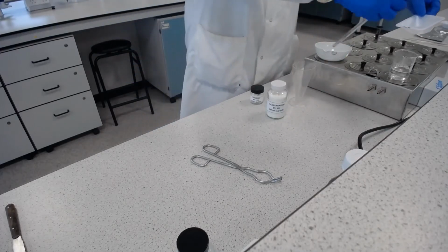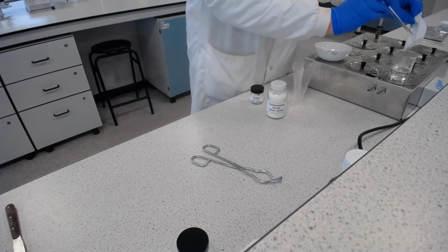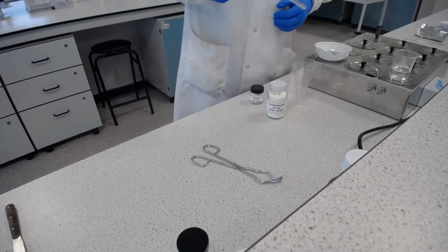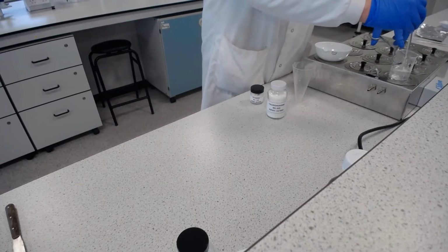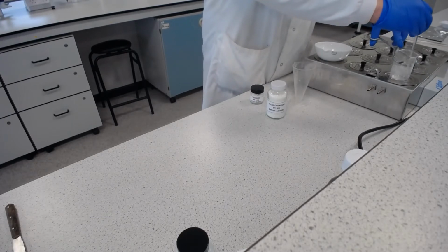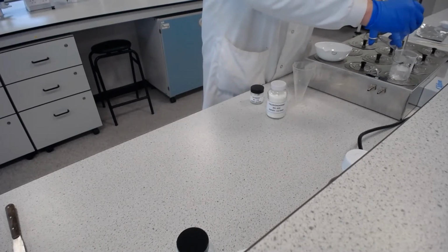So I'm just going to add the chlorhexidine. And you can work out the exact amount of water that you need to put in simply by adding up the masses of all of the other ingredients and then taking that away from the final volume. As you're mixing this, you might notice that you start getting some bubbles on the top. And as you know, when you use a surfactant, you also get bubbles on the top. So maybe have a think about some of the molecules that are going in here and how we're actually managing to mix the water and the oil phases together.